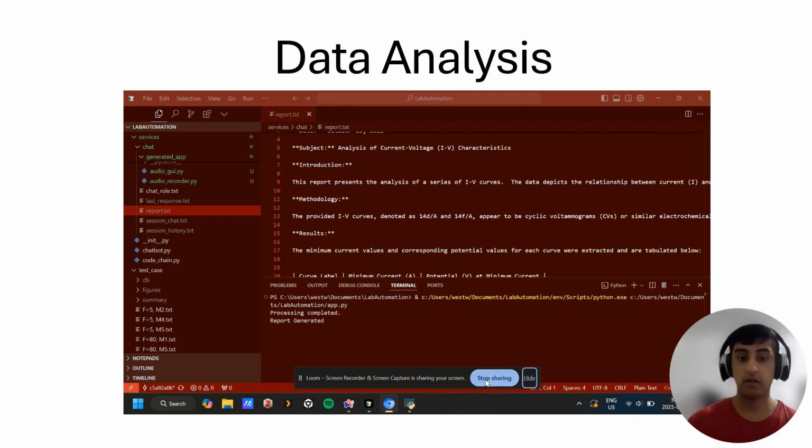So this tool is something that I hope would be useful for other researchers and would hopefully help with automating the mundane tasks so researchers can actually focus on doing things that matter to them, which is sitting out there and doing cool experiments, doing cool literature review, building new things, instead of having to do the mundane and repetitive tasks of sitting in a place and pressing the same button over and over again.